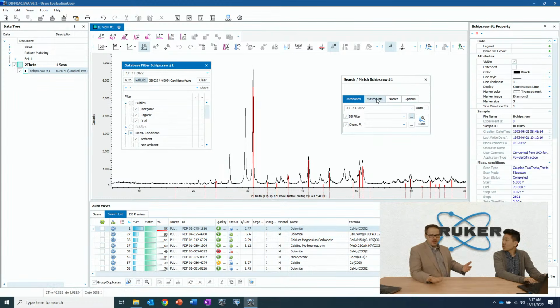So the analog would be, if we're doing a search match and you're looking at cement, it's generally going to be certain things. And looking at this, even something as simple as organic or inorganic. As one of the resident chemists here, right? I like this: does it have carbon in it, or is it inorganic?